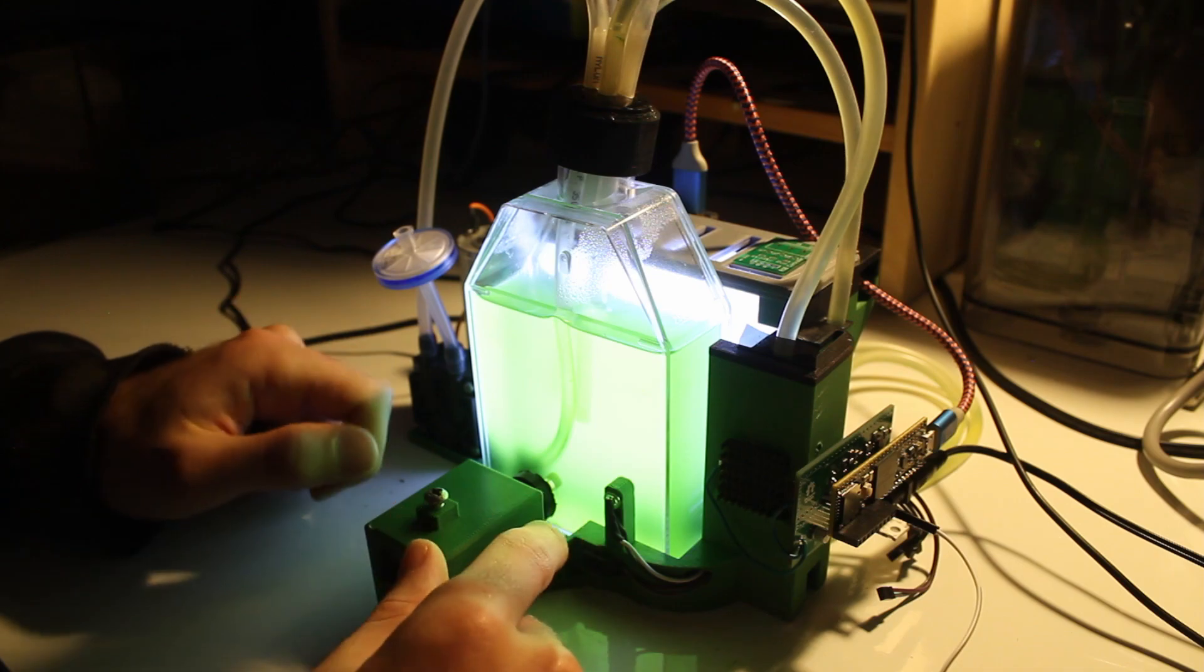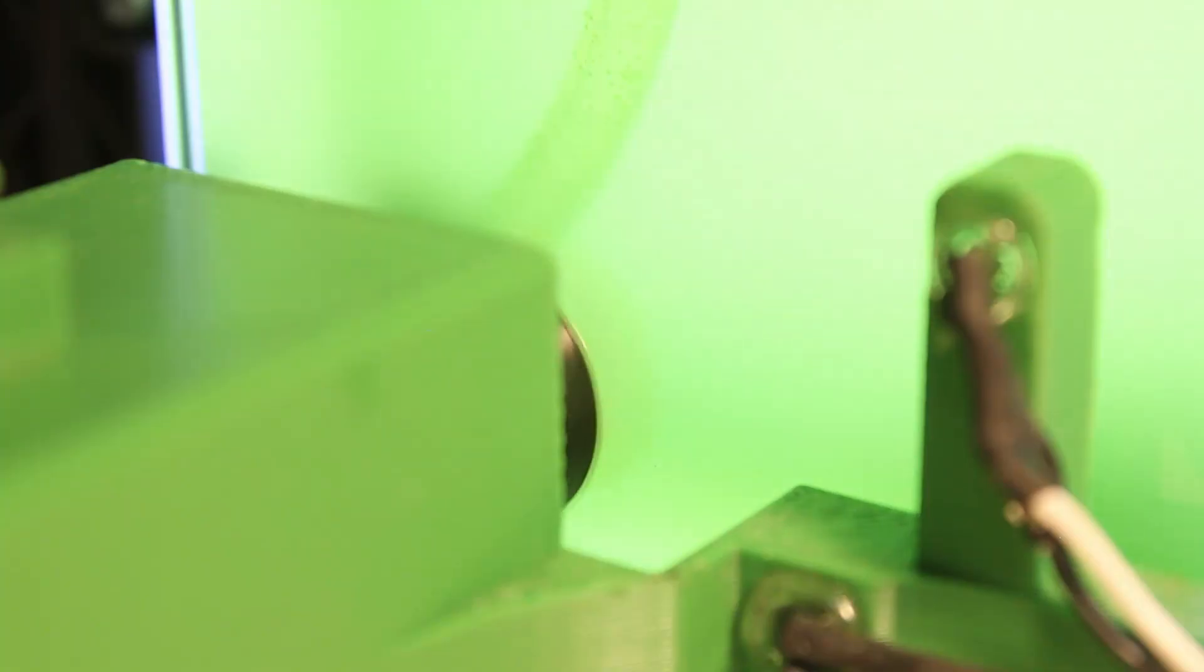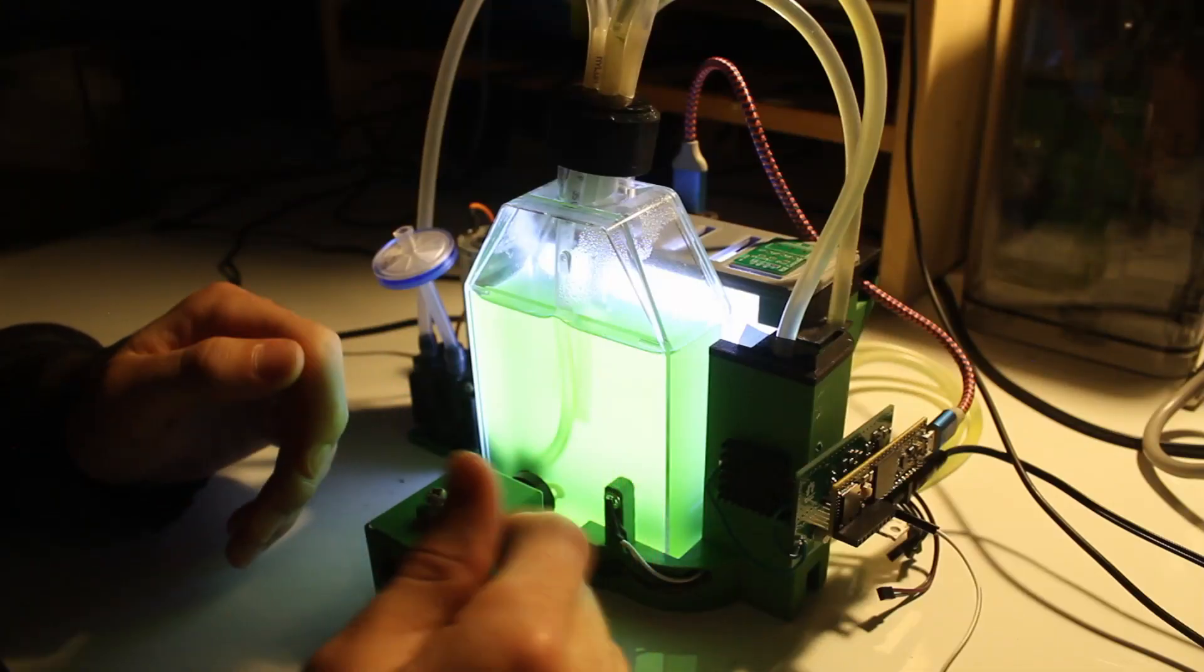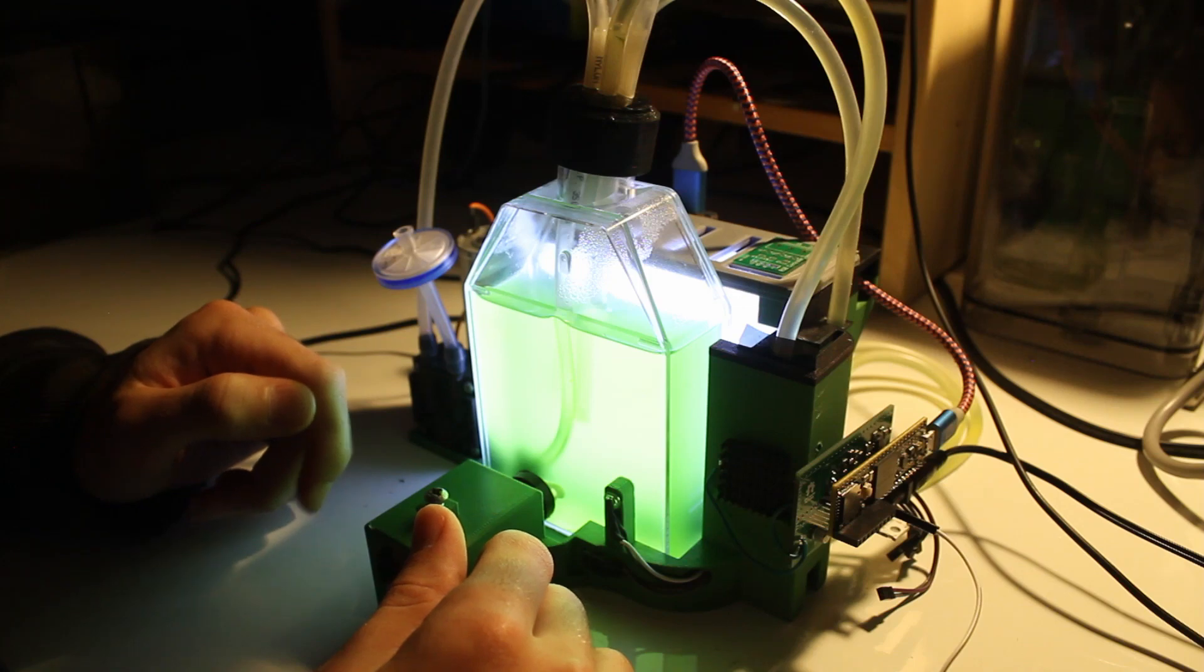We also want to keep the algae suspended in this liquid culture, so we have a mixing motor located on the front of the device just to spin the algae up and keep it from settling on the floor of the culture vessel.